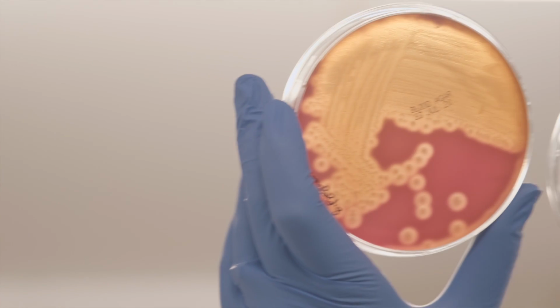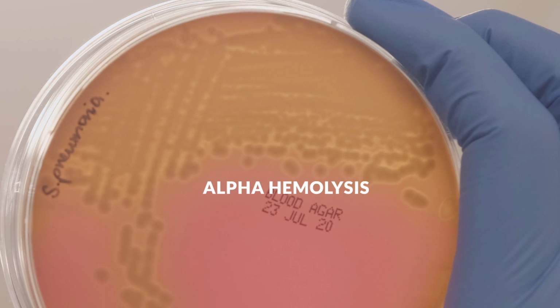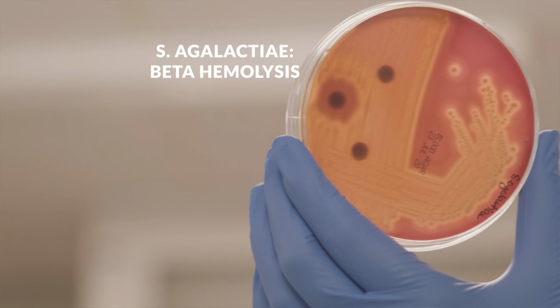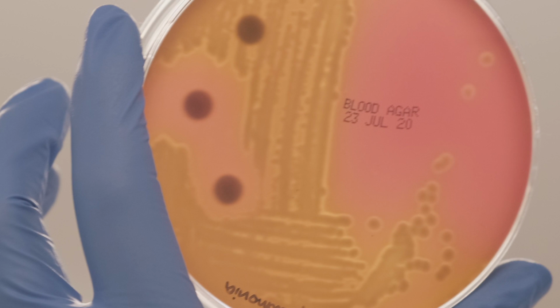Hemolysis on blood agar is the first point of differentiation across streptococcal species. Alpha hemolysis is characterized by an indistinct zone of partial destruction of blood cells around the colony, often with a greenish to brownish discoloration. Beta hemolysis is a clear colorless zone around the colonies where the blood cells have undergone complete destruction. Strep pyogenes and Strep agalactiae demonstrate beta hemolysis, while Strep mitis and Strep pneumoniae demonstrate alpha hemolysis.